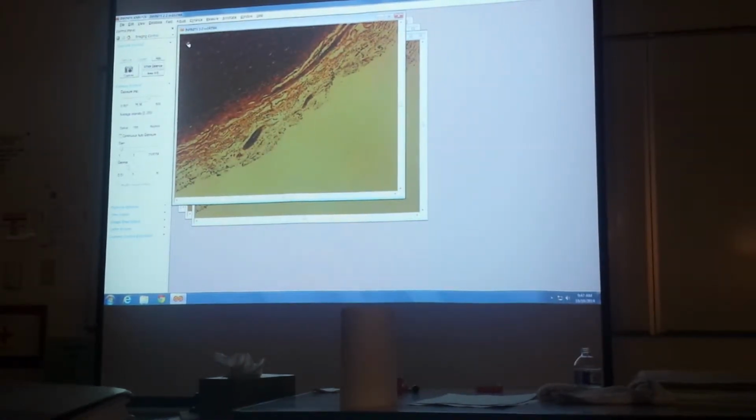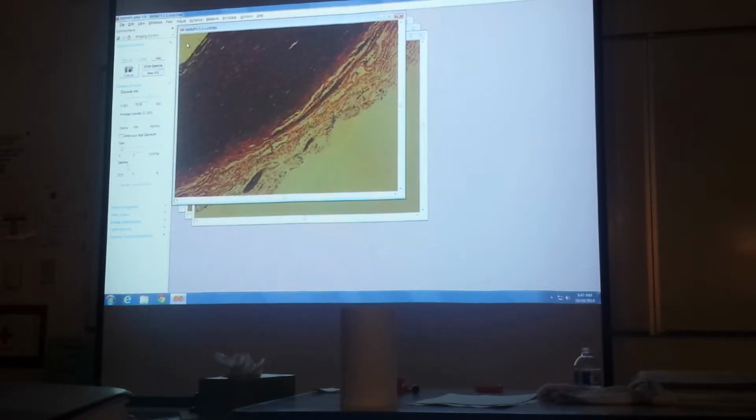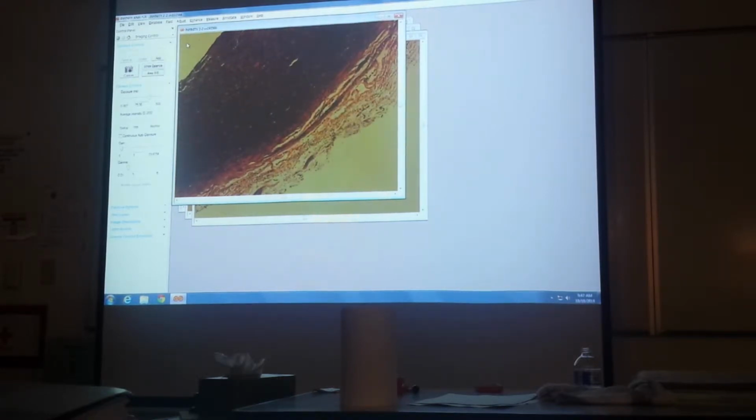And I want to move on and look at your study guide for anything that I could possibly ask you. So the elastic fibers dominate the elastic artery. But what's also in them? Smooth muscle. Basically, all you see here is collagen fibers.